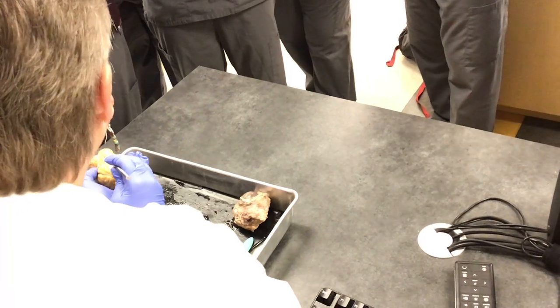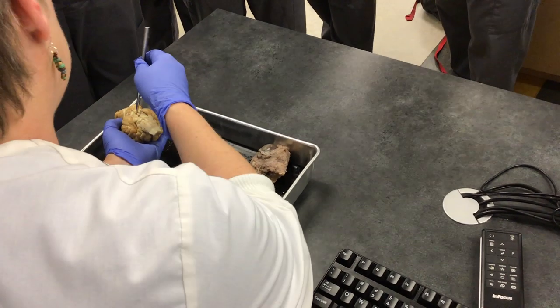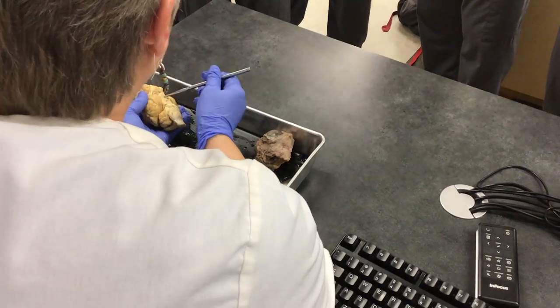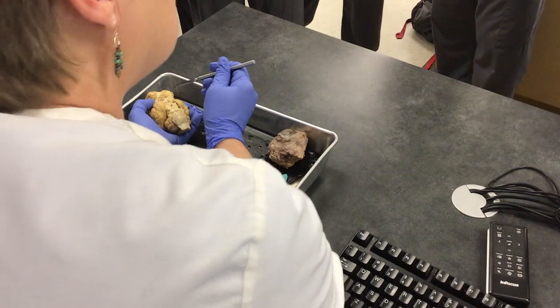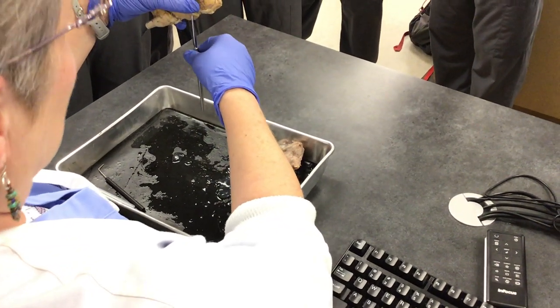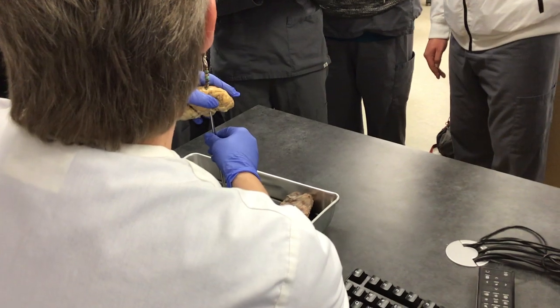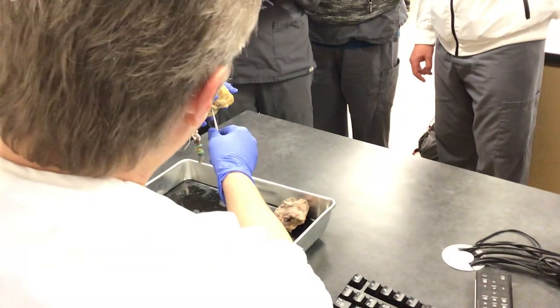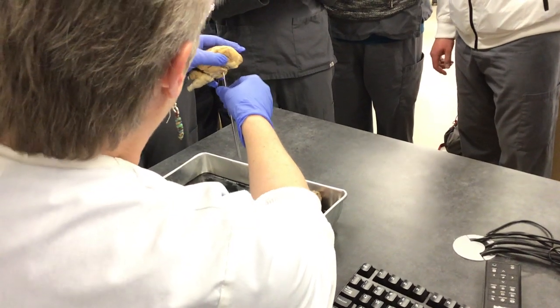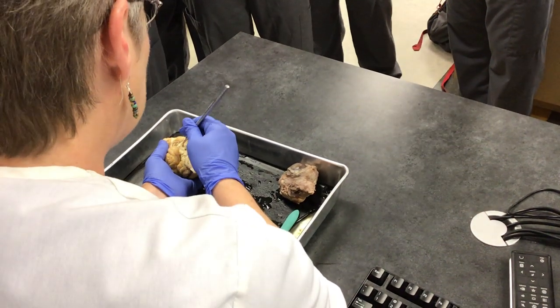Right here, you see this little opening — you can actually take a pointer and put it inside. This is the infundibulum, and unfortunately what was here was removed when they prepared it for dissection. But if it was still there, it would be hanging just like this — it's the pituitary gland, otherwise known as the master gland. That's where the pituitary gland attaches.